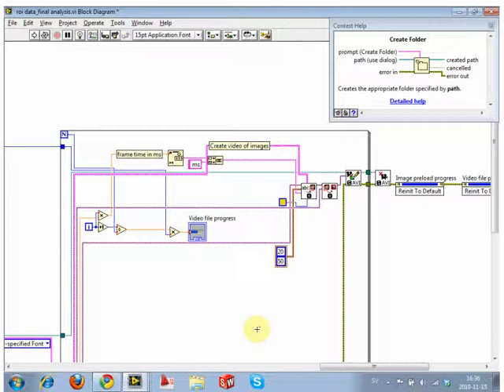There are also free programs available on the net. Yeah. More than one. But they mostly need bitmaps, actually. Most of them do. The reason why those programs require bitmaps is because they don't open the images. It kind of sticks them together. Because an uncompressed AVI is a stack of bitmaps. It kind of writes a container code for a set of bitmaps. It doesn't open the bitmaps. Whereas if you've got JPEGs or TIFFs or anything else, it has to open the file.